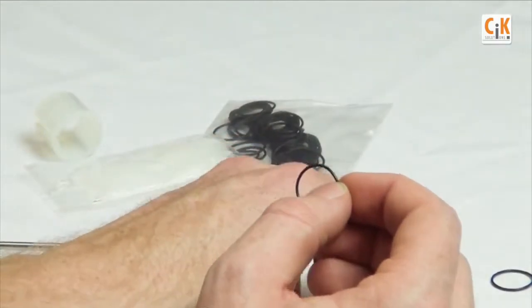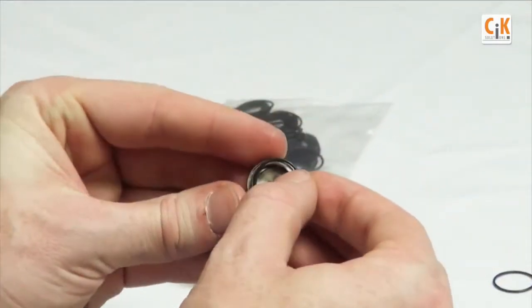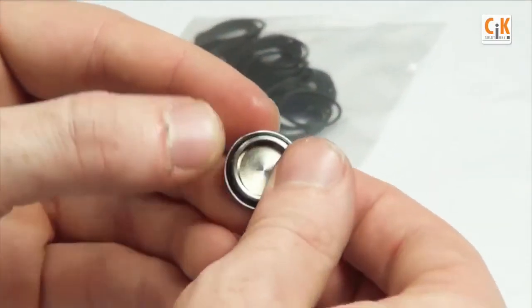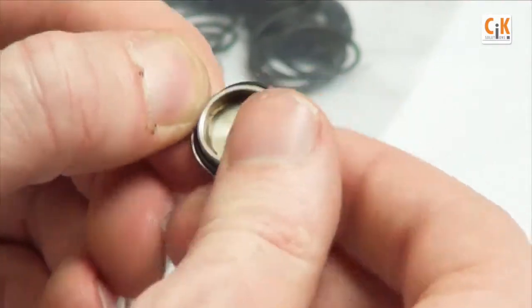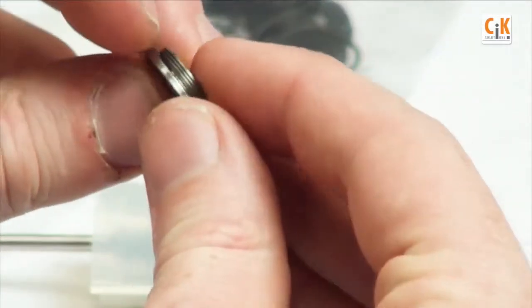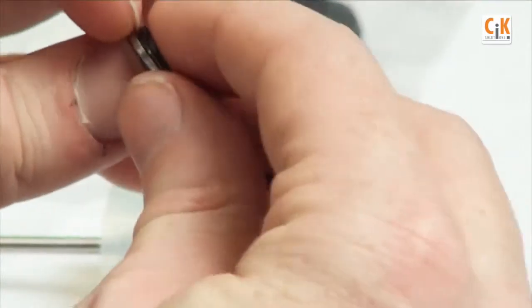Then place the o-ring in the groove of the battery cap. You can use your fingernails to make sure it's fully seated.